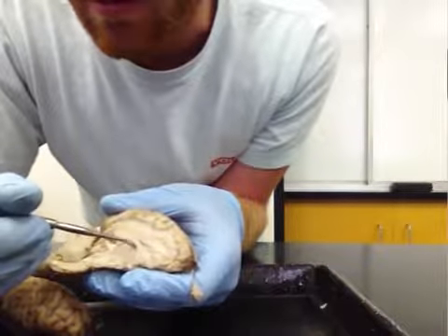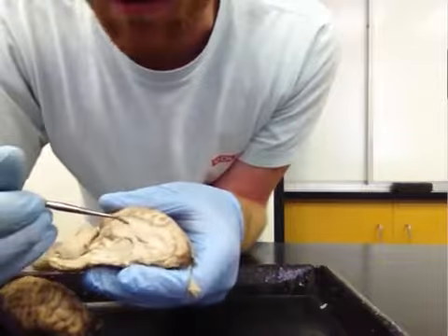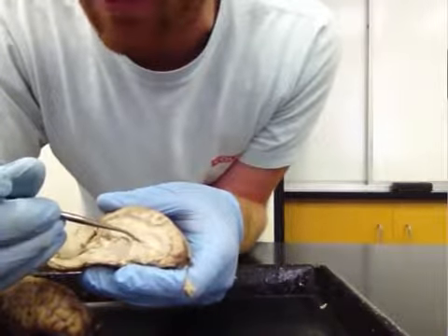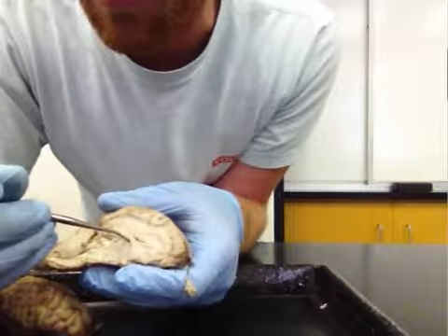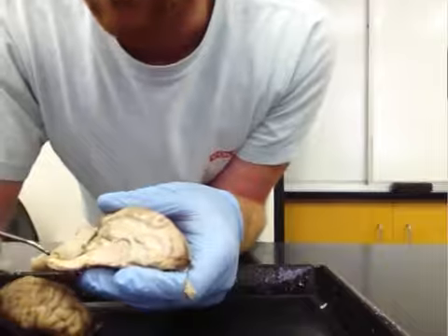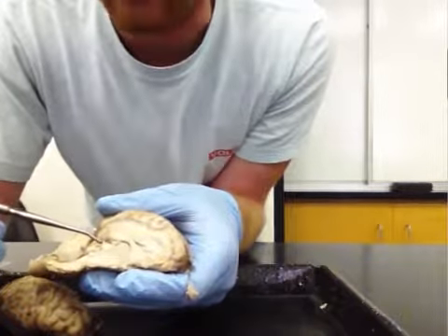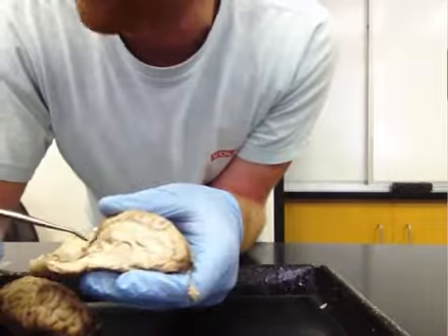There's a little bit of space right next to the corpus callosum, and these are the ventricles. Particularly here's the lateral ventricle, and you have the third ventricle surrounding the thalamus. So these are some of the structures that we'll be able to see. In addition to those, there'll be some other ones that are outlined in your Lab 2 protocol.